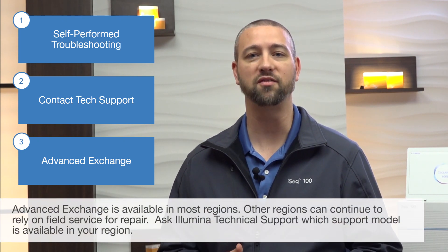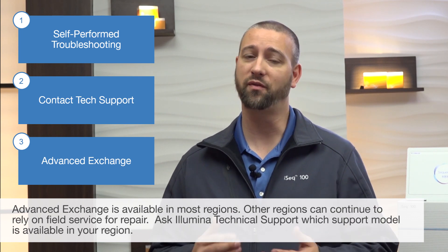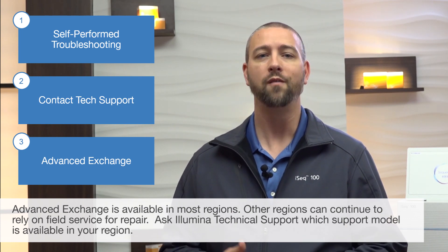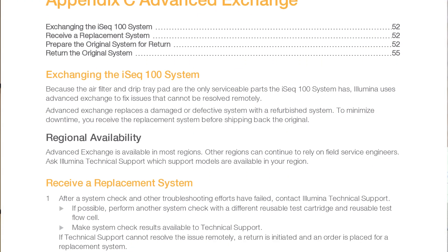If an instrument issue can be determined but cannot be resolved remotely, Illumina can enter the advanced exchange process. Advanced Exchange replaces a damaged or defective system with a refurbished system. To minimize downtime, you receive the replacement system before shipping back the original. For more details, see the Advanced Exchange Appendix section of the iSeq 100 system guide.